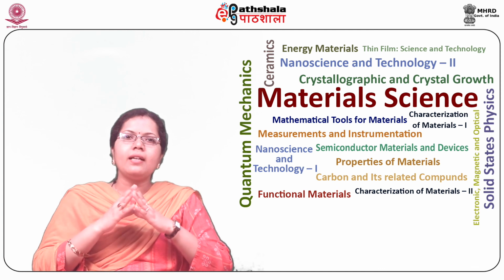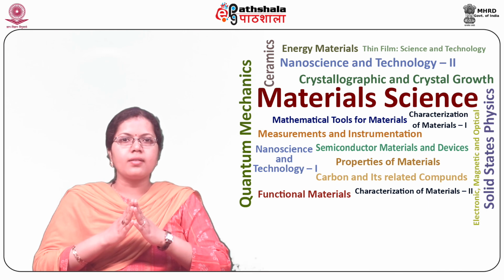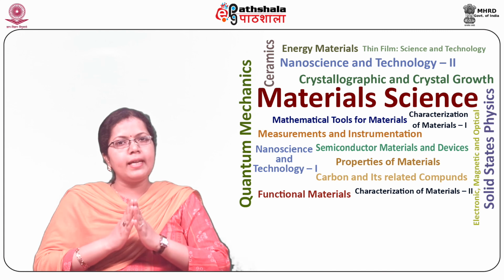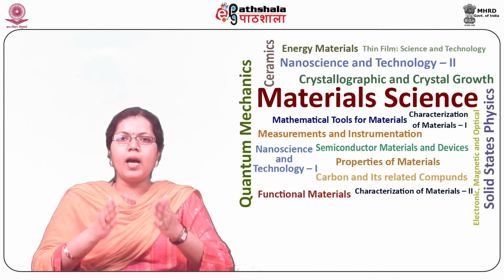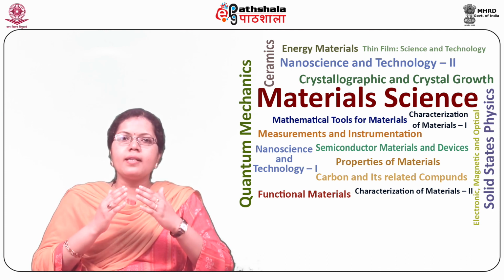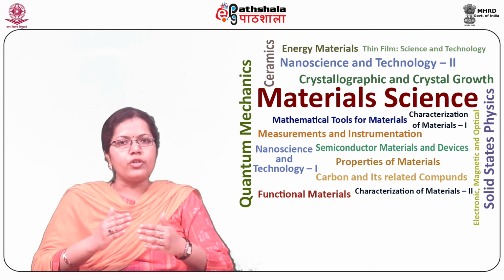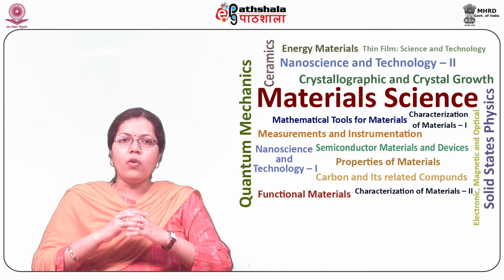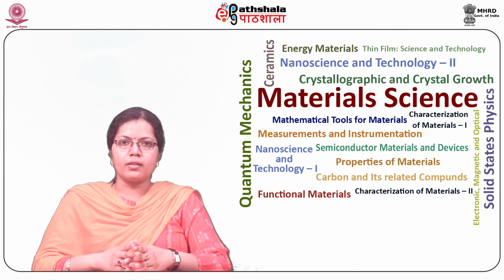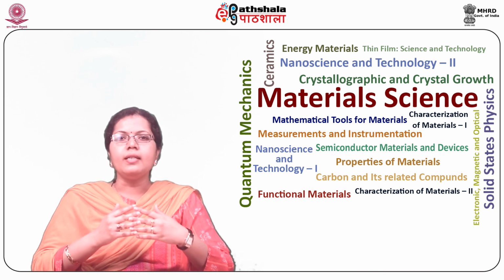Students, now let us study about the advantages of differential interference contrast microscopy. An advantage of DIC is that the sample appears bright with a dark background. The technique has the advantage of using a full width condenser with aperture setting, whereas the original slit condenser produced a thin vertical beam of light, thereby limiting the amount of light focused on the sample surface.